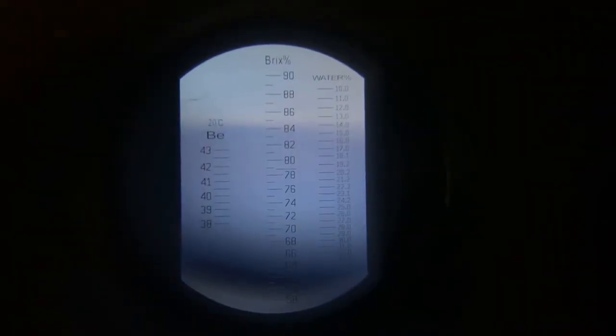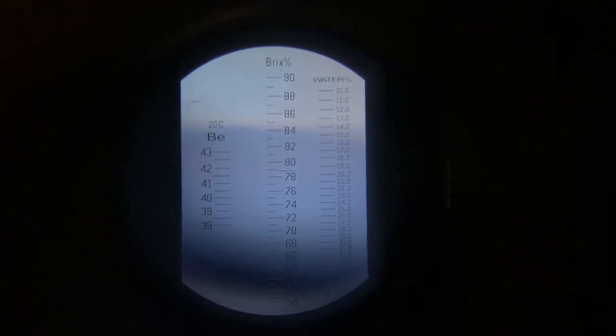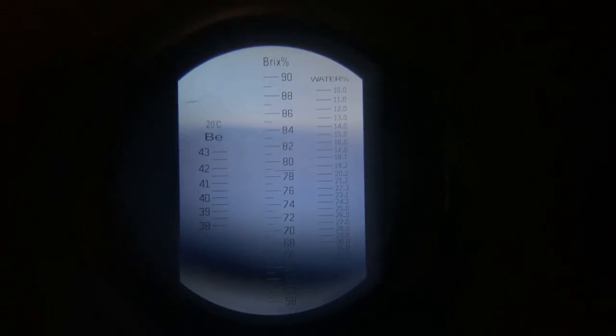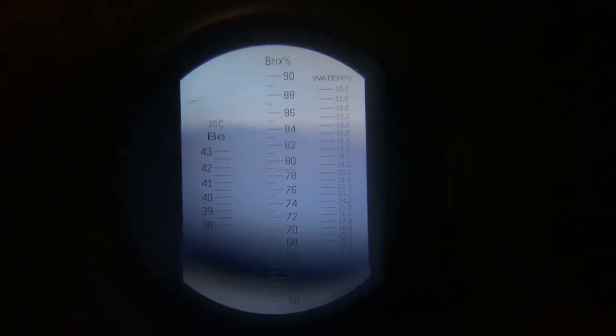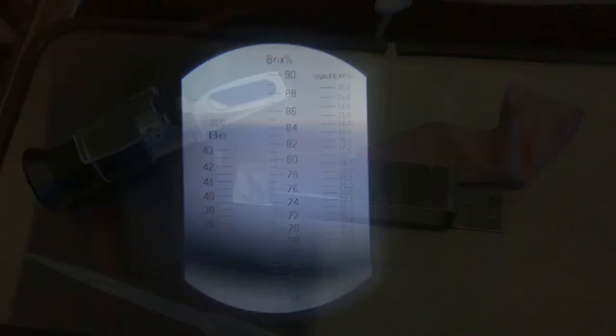This is what it looks like when you look inside a refractometer. On the right-hand side is all you really need to pay attention to. You want to ensure that your honey is below 17% moisture—you see that 17.0. You'll see in a second when we put a little droplet of honey on it.